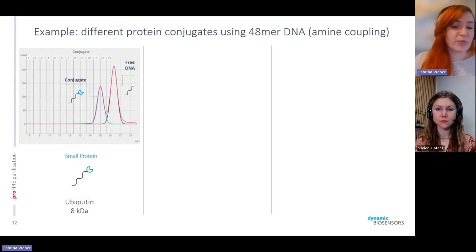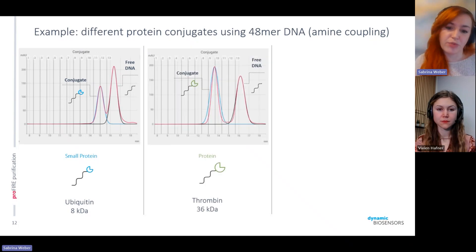If we choose a protein that's slightly bigger — in this case, thrombin at 36 kilodaltons — you can see that the elution profile changes and the protein-conjugate elutes earlier than the previous example. This makes the separation and purification even better because it really ensures there is no free DNA overlapping with the conjugate sample.